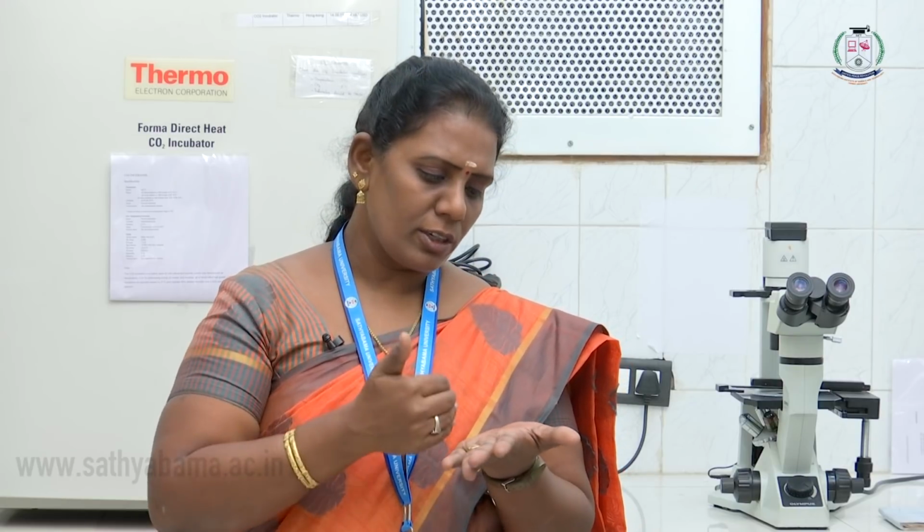Why we keep it for 1 more day: the drug has to show its action. A competition has to happen between the two, and the drug has to show its pharmacodynamic and kinetic effects. Depending upon the concentration, the cells will die or the drug will have its action or not, and that has to be evaluated. If you put different concentrations, the cells and the drug compete with each other. So for that we leave it for the 2nd day. On the 3rd day we remove all the content.